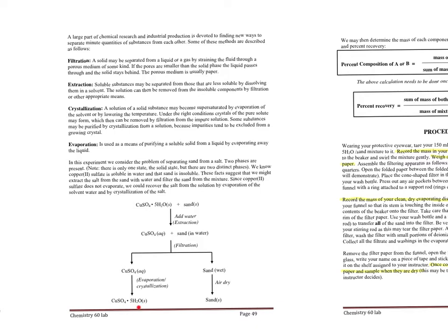And this is called a hydrate. For every one copper(II) sulfate ionic compound, we have 5 water molecules bound together. This is just the most stable form of this compound. We call this a hydrate: copper(II) sulfate penta, because there's 5, hydrate. And we're going to be able to obtain or recover the copper(II) sulfate pentahydrate and to determine the mass of this.